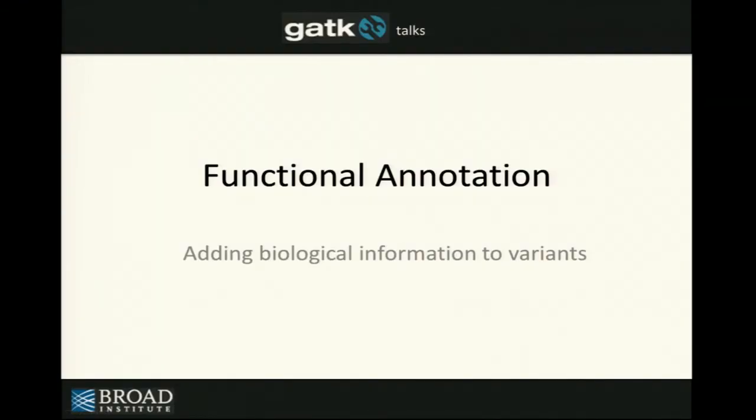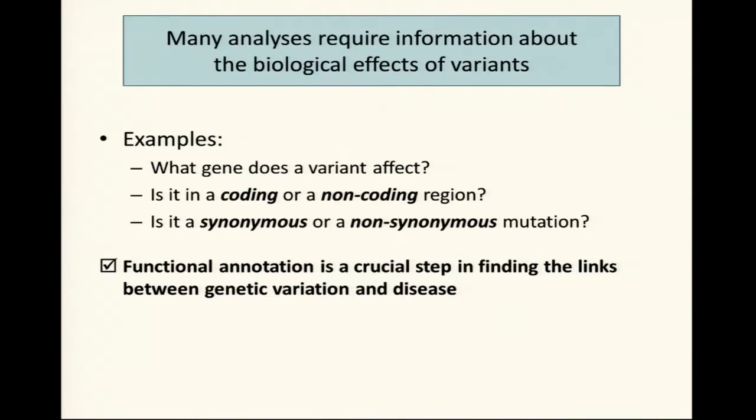So another piece on this branch where we call out into other tools and allow their output to come back into VCF is doing functional annotation, and in particular, annotating protein coding sequences for the potential effects of variation. In order to do this, we rely on a tool called snpEff. The idea behind doing this is to answer biological questions about potential protein changes that a variant might have. So for instance, a typical example would be you're interested in a particular gene or gene families, and you have discovered an amount of variation in there from exome sequencing.